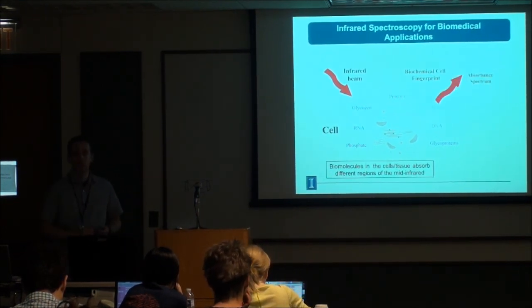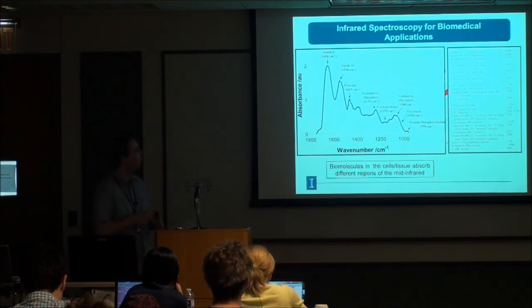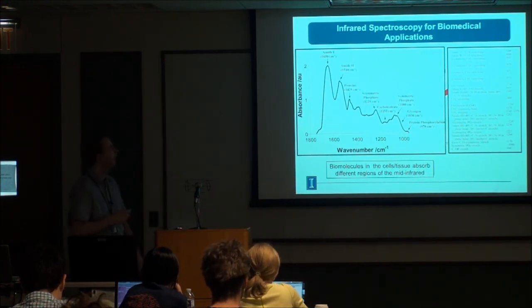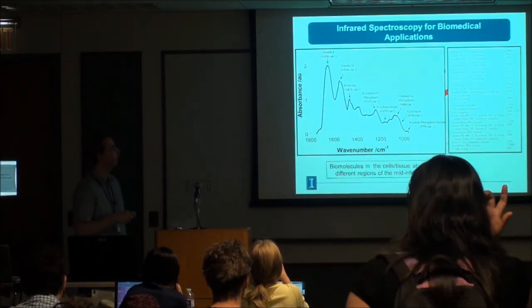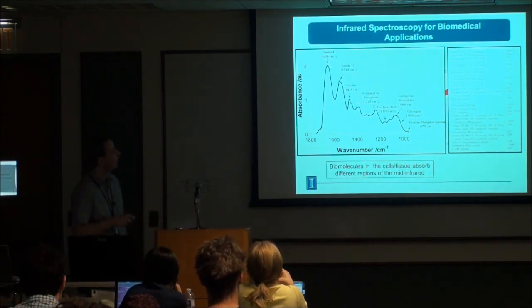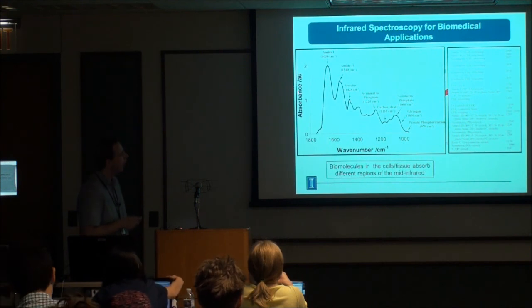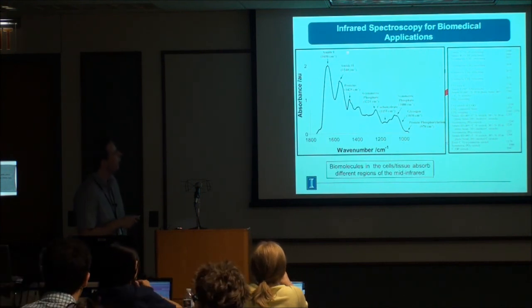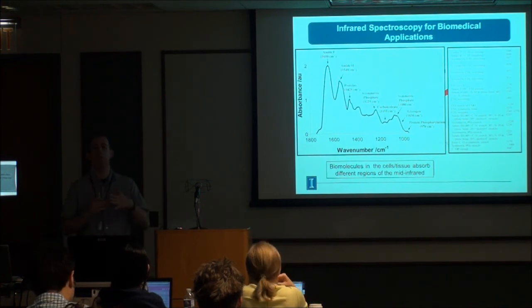From this we can derive an absorbance spectrum. This is just a small portion of what we can detect. You'll have seen something similar last week; in fact, I think you all took images of this. Essentially these different peaks correspond to different fundamental vibrations. With mid-infrared, you tend to get peaks like this, which are composed of multiple peaks.